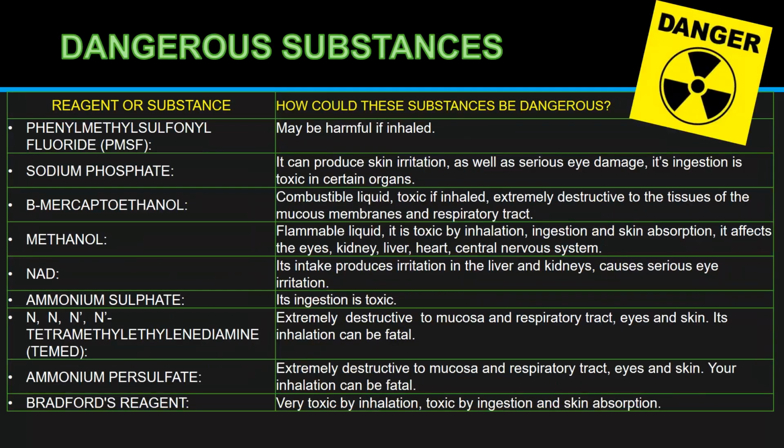Continuing with the list, we have phenylmethylsulfonyl fluoride or PMSF. This may be harmful if inhaled. Sodium phosphate. It can produce skin irritation as well as serious eye damage. Its ingestion is toxic in certain organs.